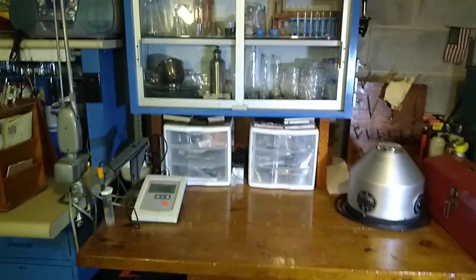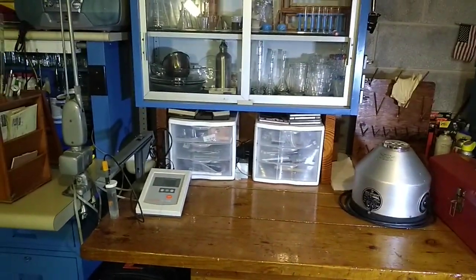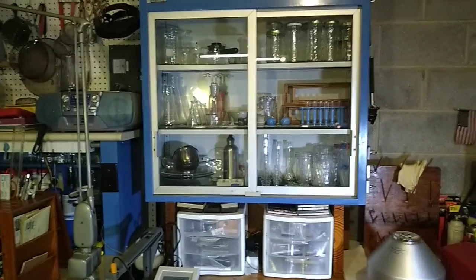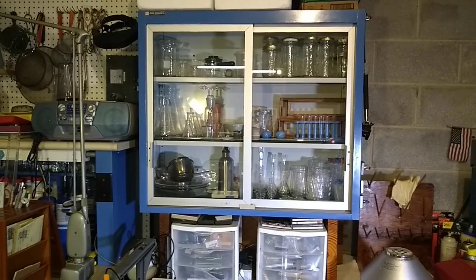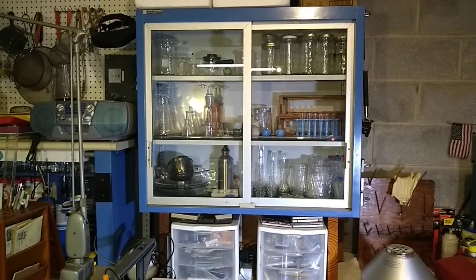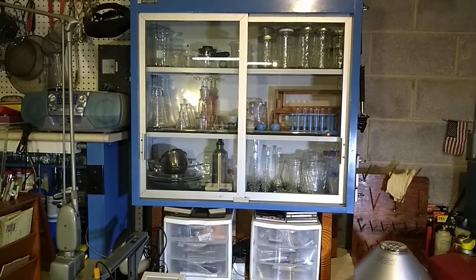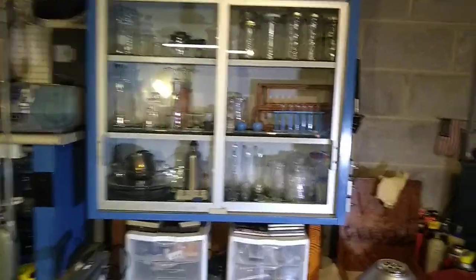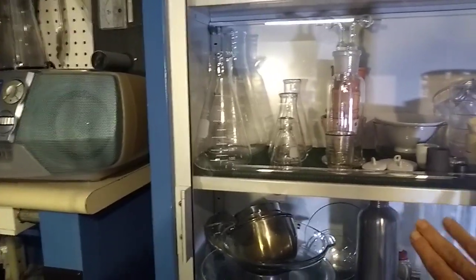Right above that I have a cabinet that's actually mounted on a stand here, so I didn't have to mount it to the cinder block wall. But that's actually a full-fledged lab cabinet made by Fixtures Scientific, and it would cost an arm and a leg new, but I think I got it for actually $2 at a state surplus store. And it's nothing really special. It's basically just a cabinet, but it does have some really nice glass sliding doors that are nice and smooth. They keep all the dust off of the glassware and all that, so that actually comes in handy.